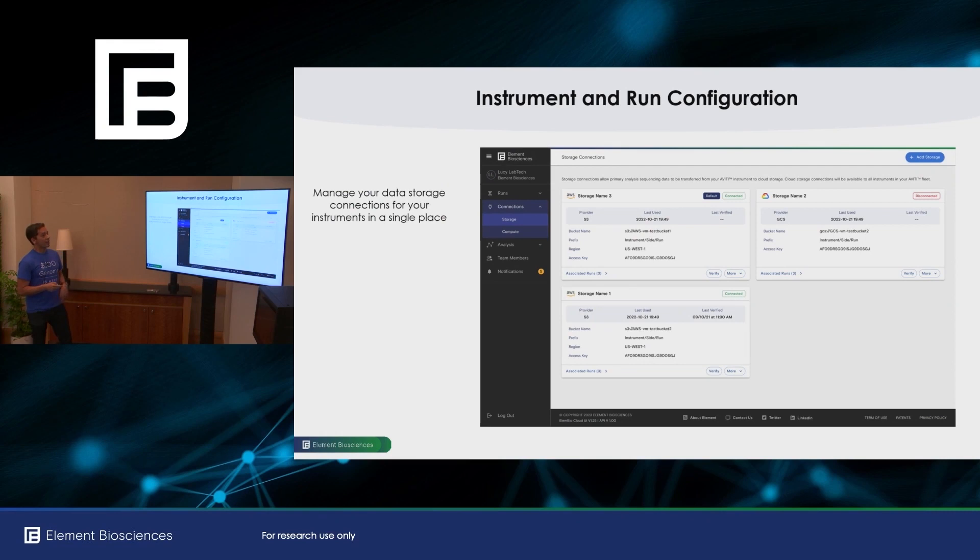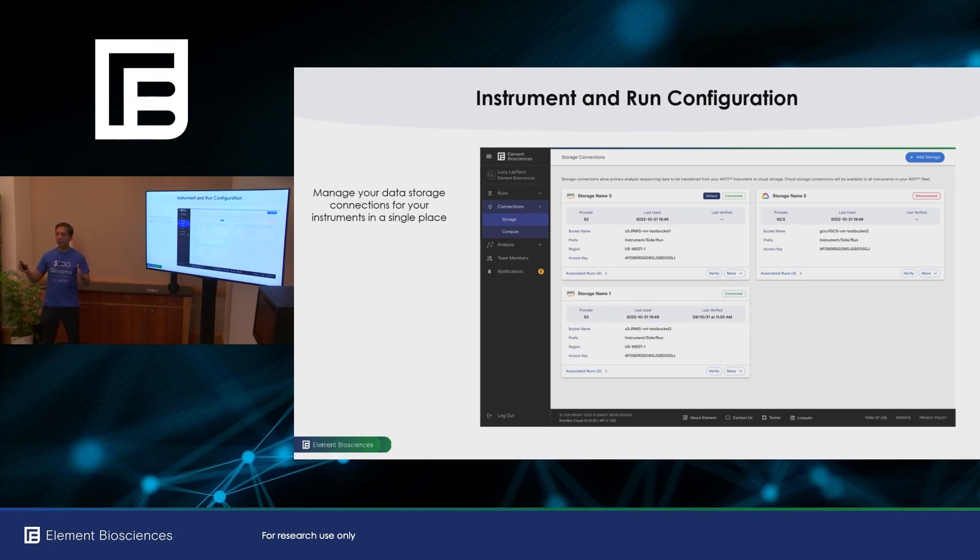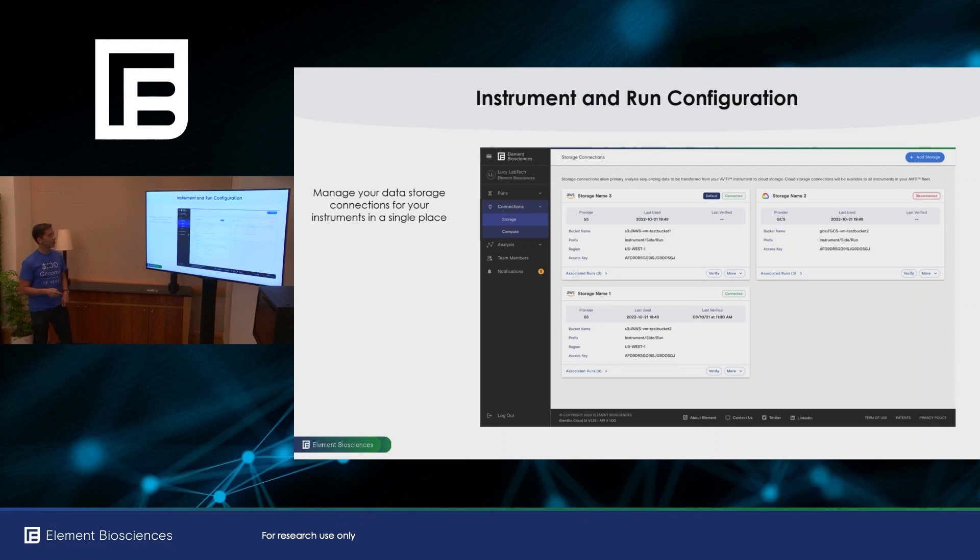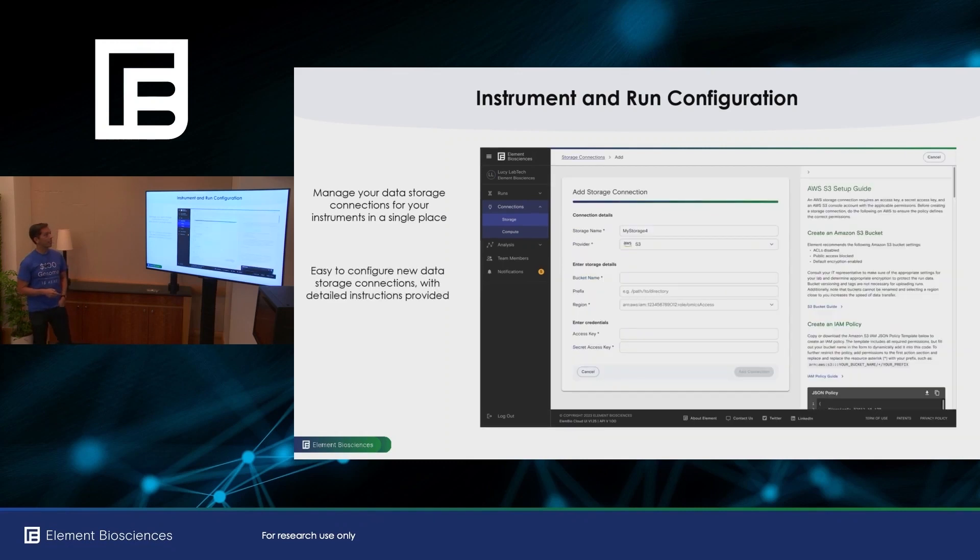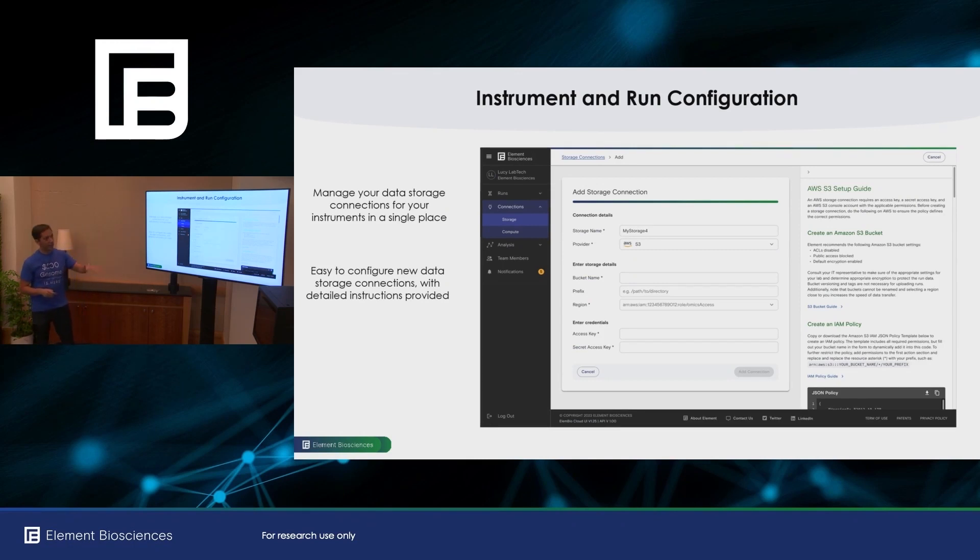So instruments, as I mentioned, each instrument can be configured to have a data storage connection to stream the data to. But if you have multiple instruments, you don't want to do that on every instrument. And so Element BioCloud will give you a centralized portal for configuring the storage connections of all your instruments in a single place. And it's very easy to add storage connections. And you'll see this as a common design element throughout Element BioCloud is that we have detailed instructions on screen on the right-hand side.